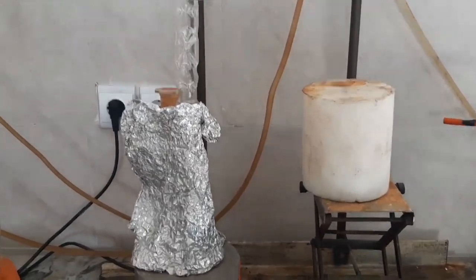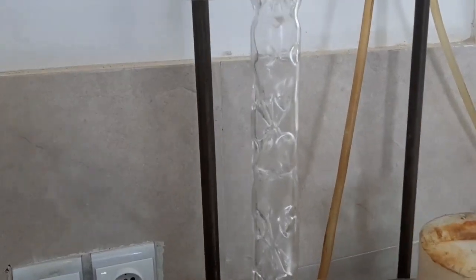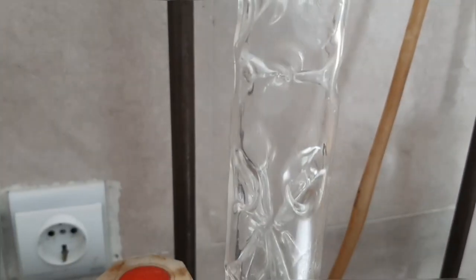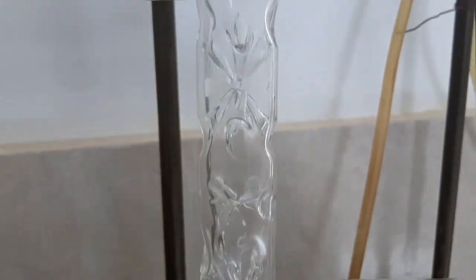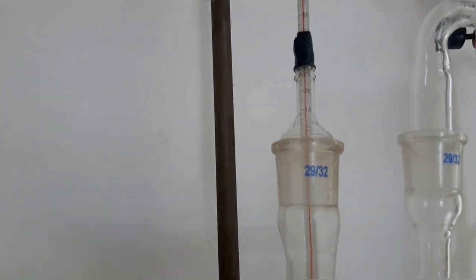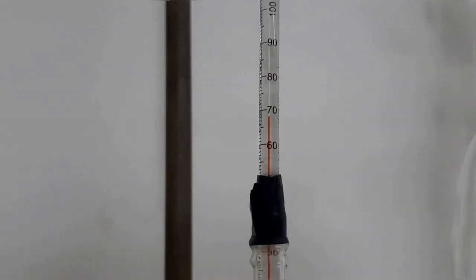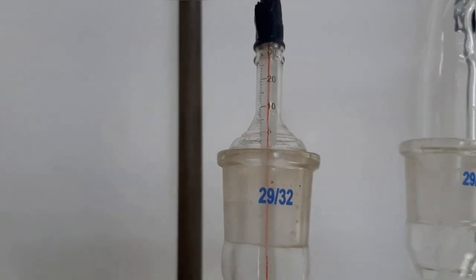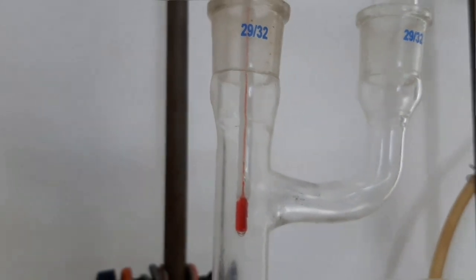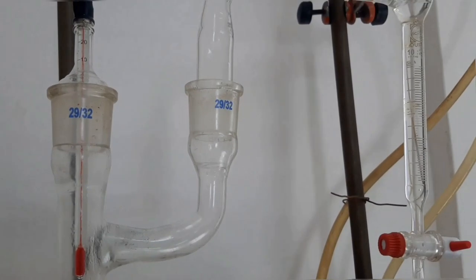So it's been a while now and the mixture has started to boil. You can see the droplets of condensate in the column. Each of these sets of spikes are a separation stage that helps us get a better product. The temperature is around 67 to 68 degrees Celsius, which is the temperature of the ternary azeotrope of ethyl acetate, ethanol, and water.